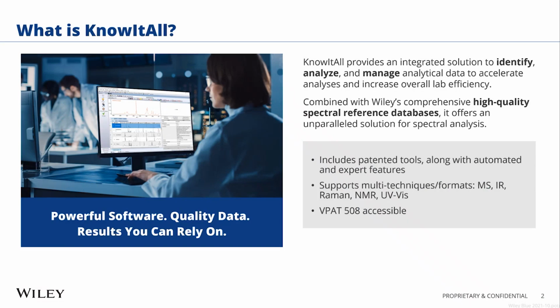So what is KnowItAll? KnowItAll provides all the tools that you need for effective spectral analysis. When combined with Wiley's comprehensive spectral databases, you have an unparalleled solution for spectral analysis. You have access to the latest technologies with patented tools that you can't find in any other packages, plus expert and automated features to accelerate your workflows.